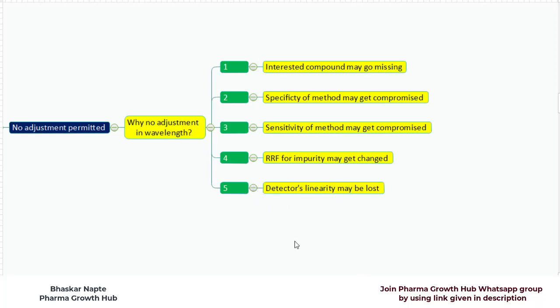Point number 5 is the detector's linearity may be lost. If the response is very low or very high at the changed wavelength, what is the guarantee that your detector still lies in the range of linear response? Your response may get saturated at the selected or changed wavelength. Hence, there can be possibility of failure in linearity. The change in detector wavelength can also compromise your detector's linearity.